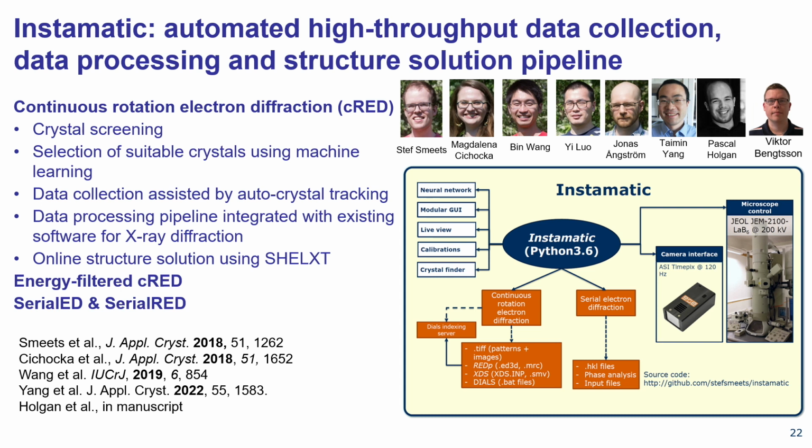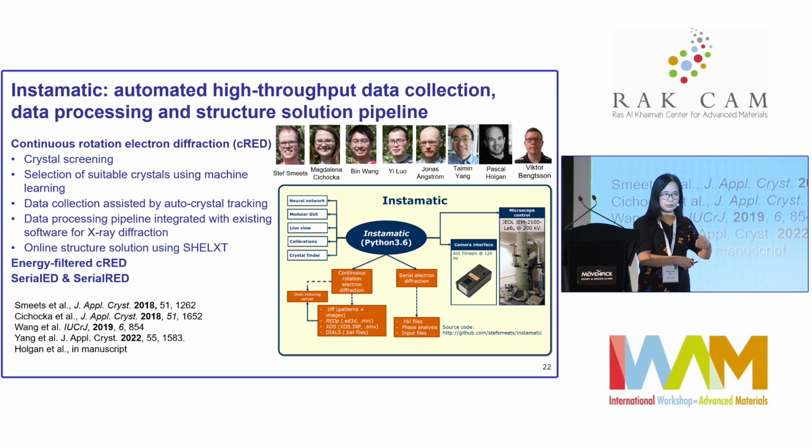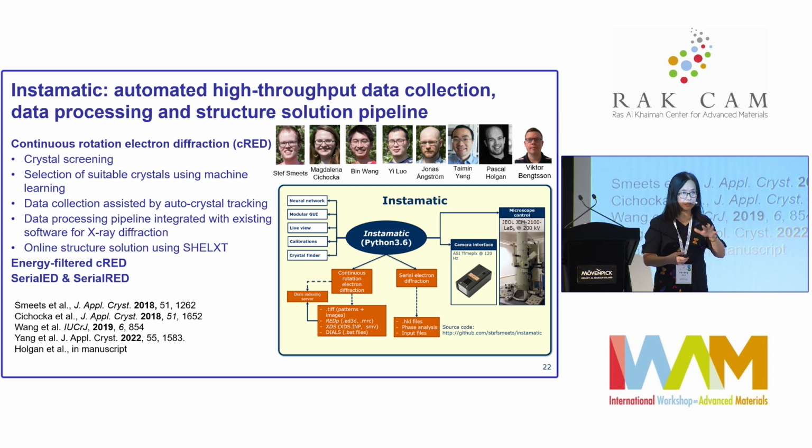Then we can collect the data assisted by crystal tracking, because when you collect data, the crystal may move. Then data processing is integrated with the existing software developed for X-ray diffraction, and we also make online data solution. We are also developing energy-filtered electron diffraction, where we hope to be able to see the charge of the crystal.